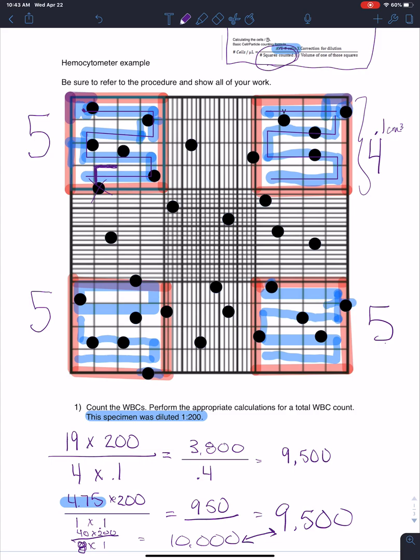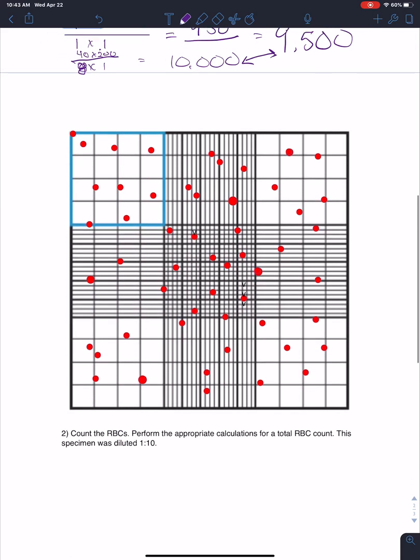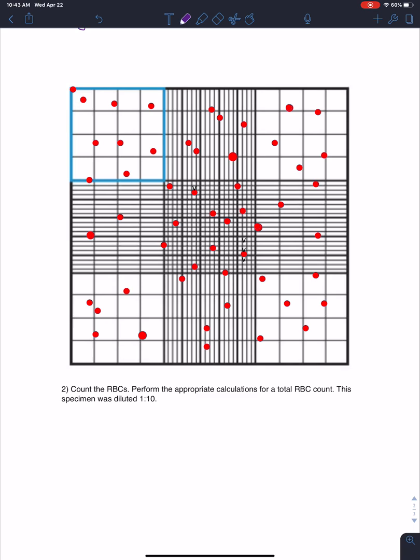Okay, so let's take a look now at our red cells. I tried to make these as close as possible as I could. So here's our red cells. Red cells are a lot smaller, so what we end up doing is counting red cells. Then we're going to use this center square here. I probably should make my highlighter just a little bit smaller for y'all. And then we're going to count these 5 squares.